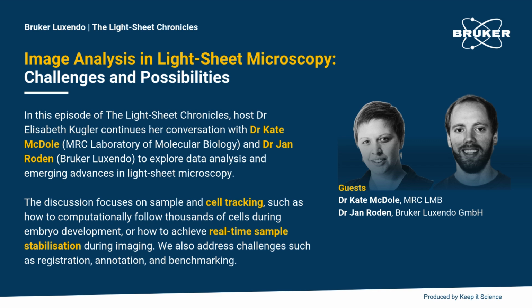And it's not just for sample drift, but also some people look at growing plants or plant roots, and those can also grow out of the field of view over time, right? So if you, for example, want to keep imaging the tip of a growing root, then this type of tracking also comes in handy.